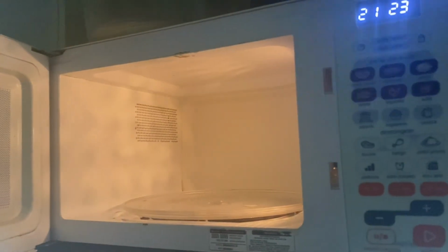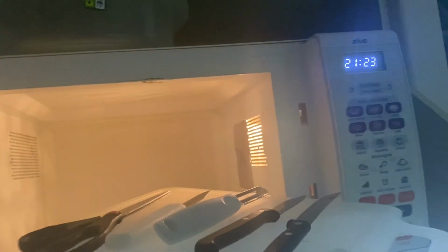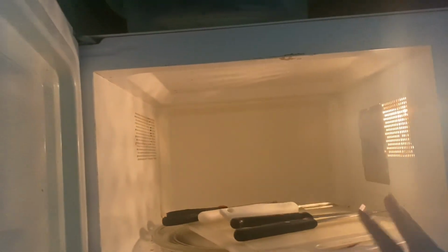This is how it's supposed to work. It's just a simulation of the real sterilization. Imagine this microwave as an autoclave. We need to adjust the right temperature and wait 15 minutes at 121 degrees for the sterilization to be over.